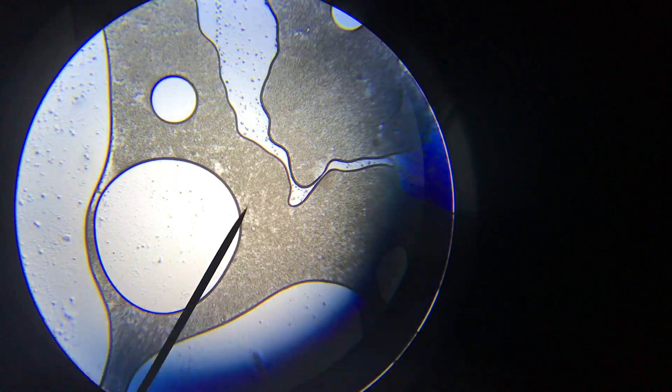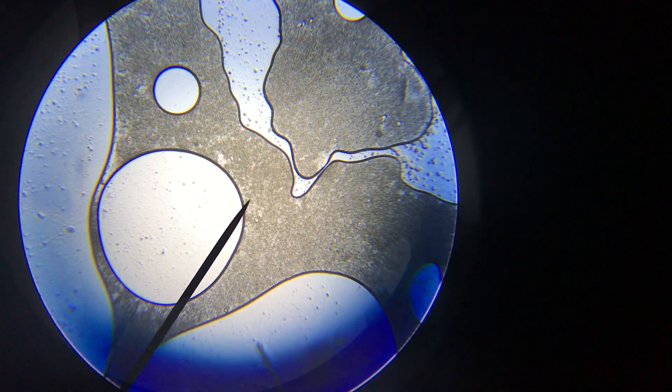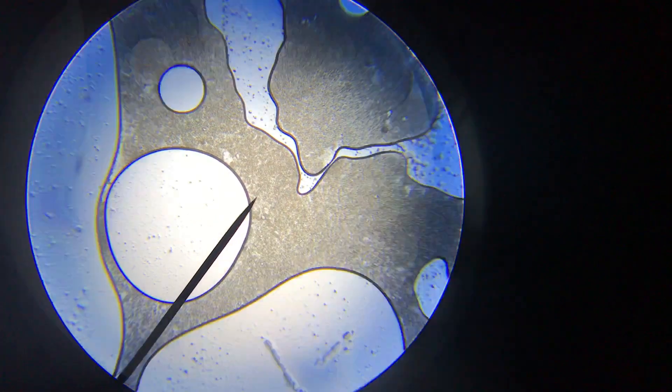This is yeast — a yeast, warm water, and sugar mixture. The yeast are forming bubbles, releasing carbon dioxide, and that's how they expand the area, like for bread.